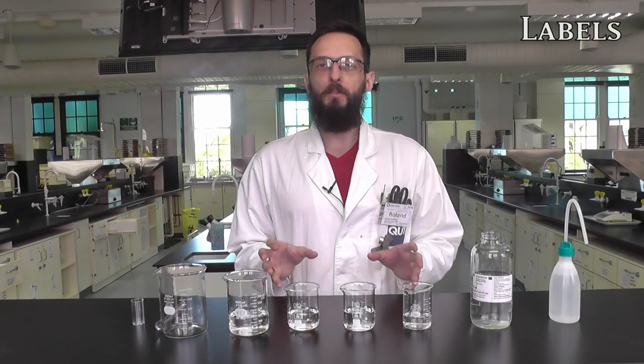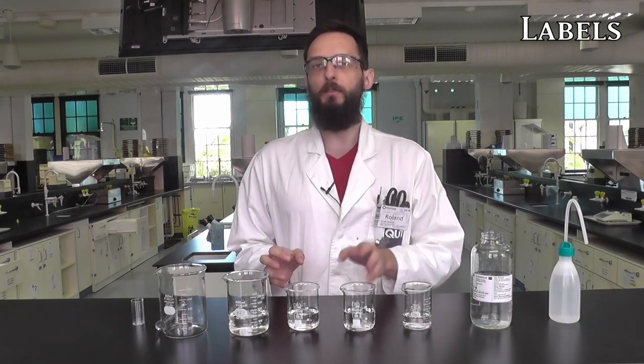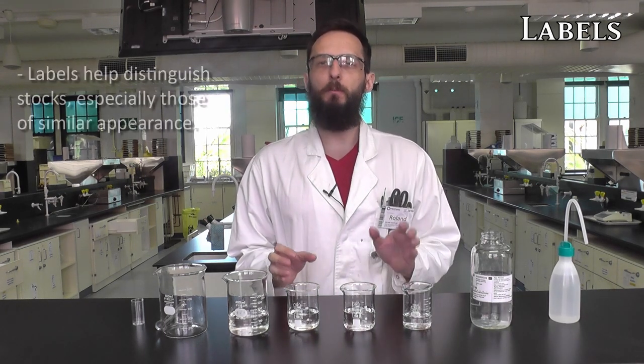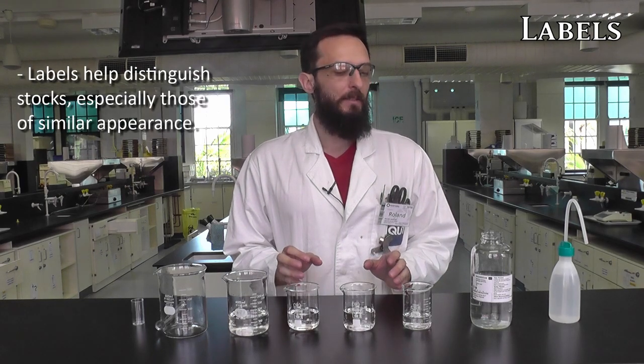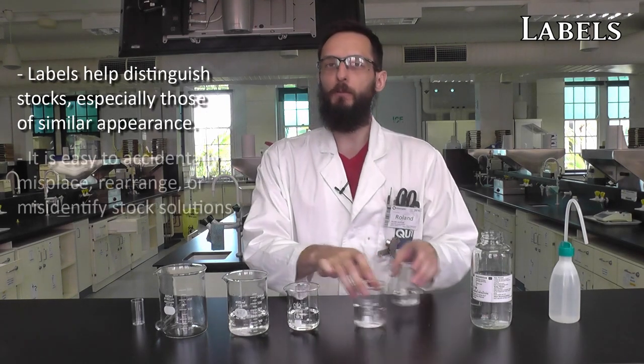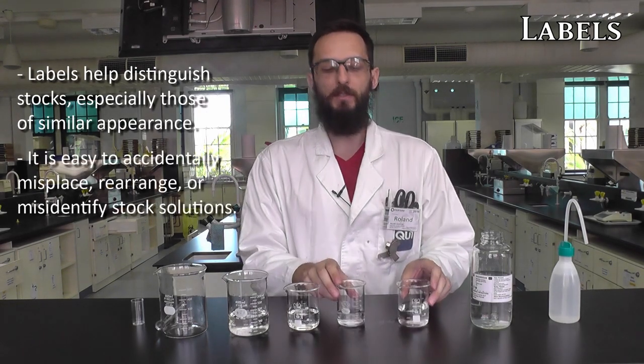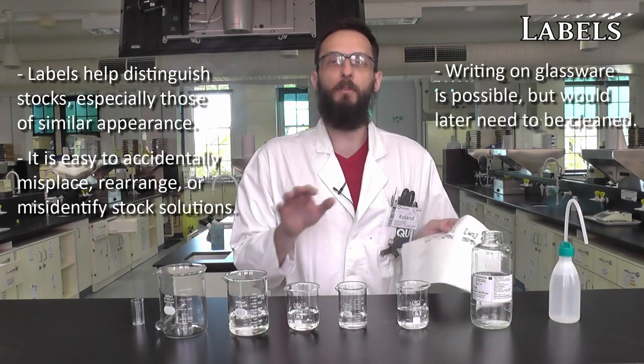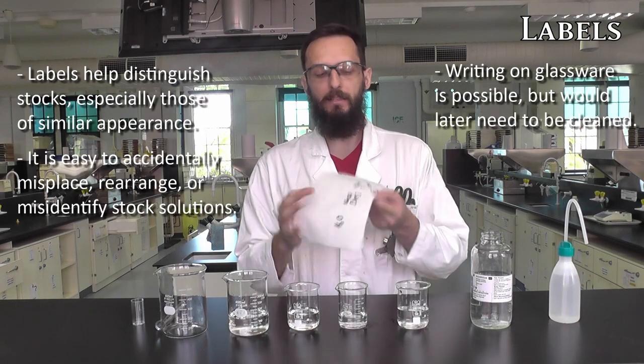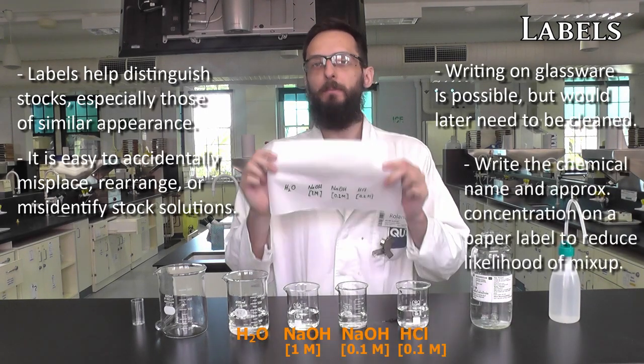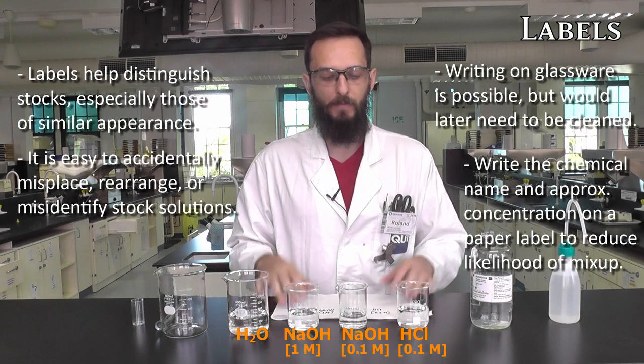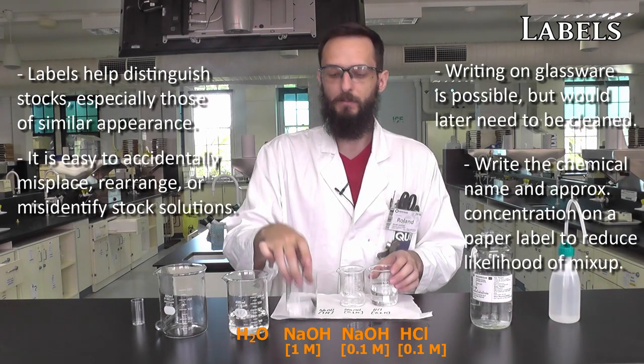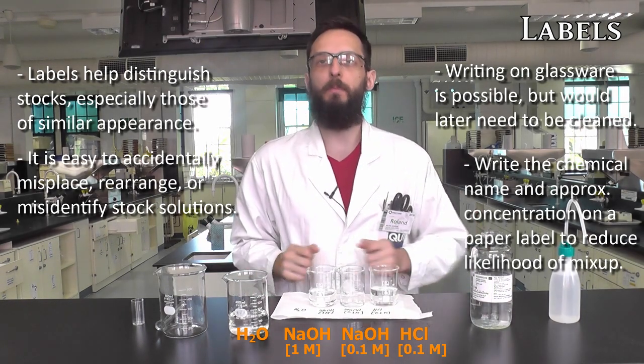A lot of the time when you're working in the laboratory, you may find you wind up with solutions that are colorless and odorless, and there's no real way to differentiate between them easily. So rather than risking confusion if you were to misplace the stocks, you can label each of them. Rather than writing on the glassware directly, which just means more cleaning later, I would recommend getting some paper towel and drawing small labels that include the chemical name and the concentration, and then just put them in the right spot.